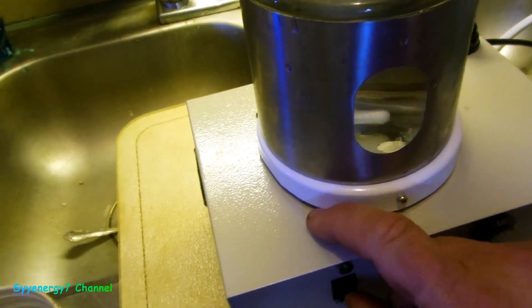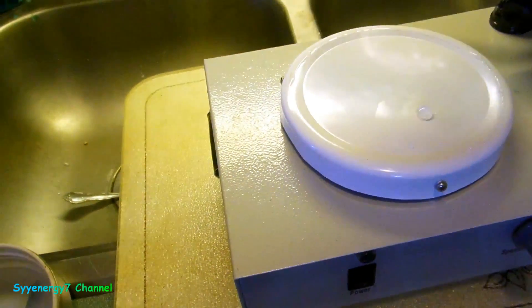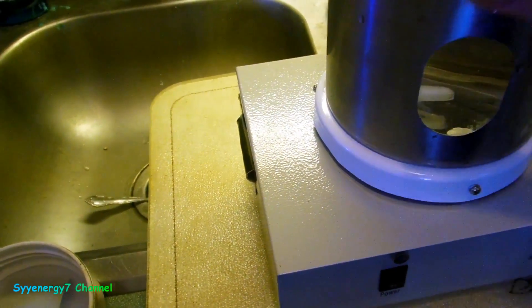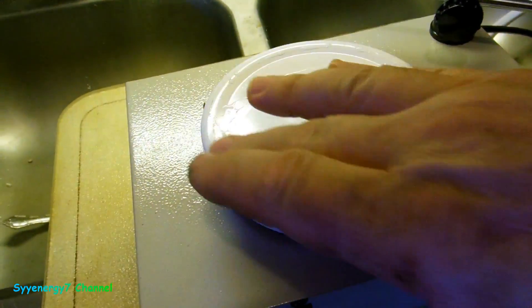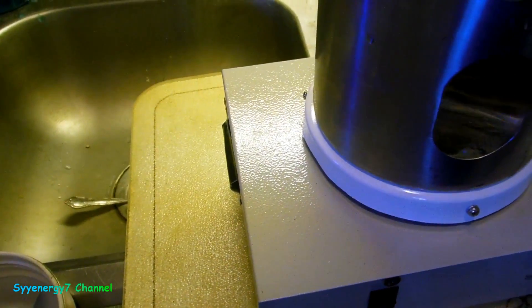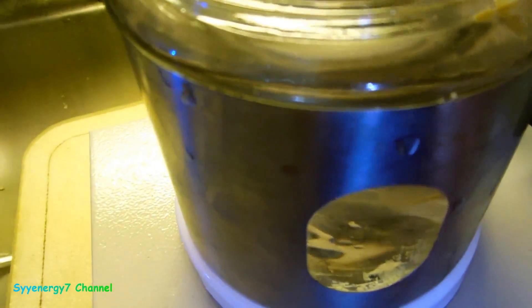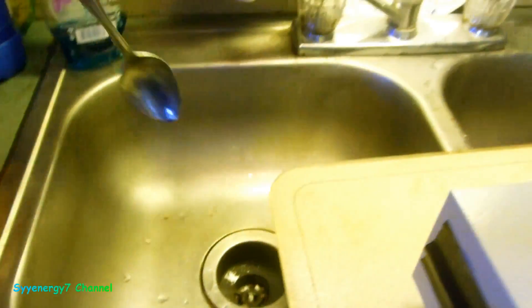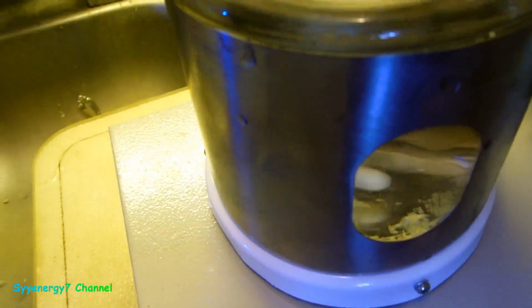I'll shut this off a second. First speed it up, turn it down, and take this off here a second. See this? I don't know where you get these if you can get these anymore, but this thing fits in here almost perfect. Like, there's this lip here, and this thing almost fits in here perfect. So I don't even think you need to have this on here. I mean, that's how good it is, that's how good it fits. It's not going to go anywhere.